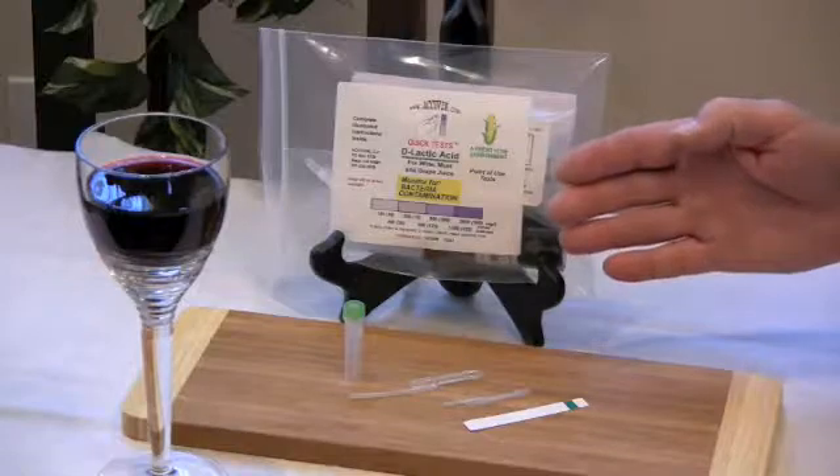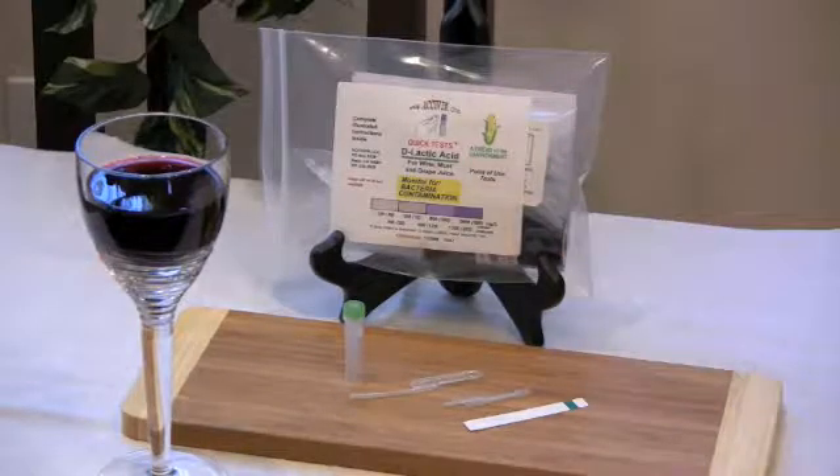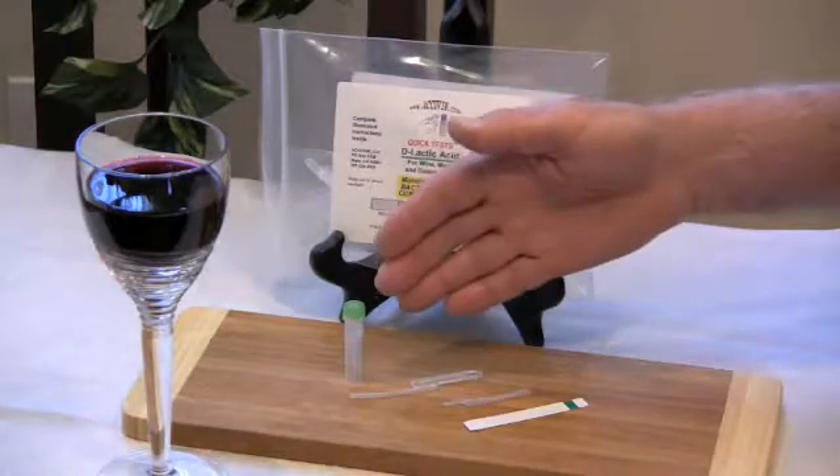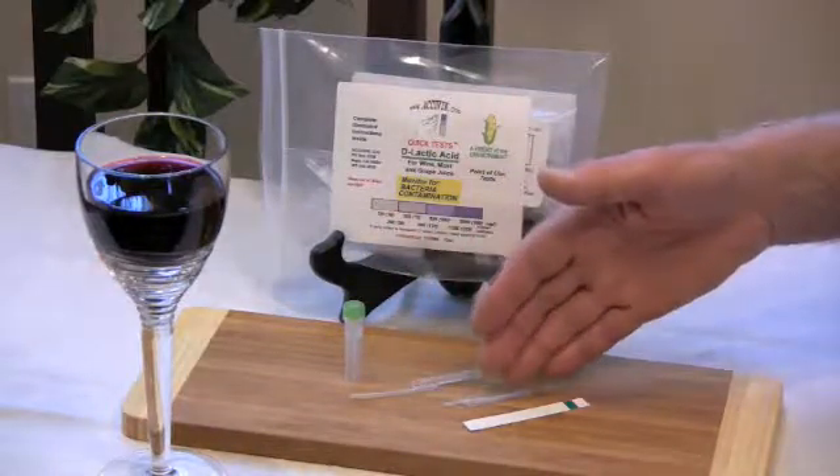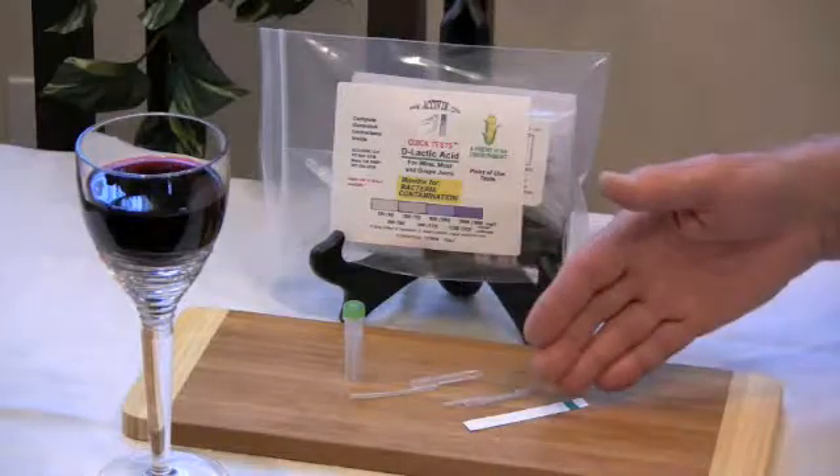This is a D-lactic acid test kit. To run a D-lactic acid test, you'll need a diluent tube with a green cap, a long tip sampler, a short tip sampler, and a test strip.